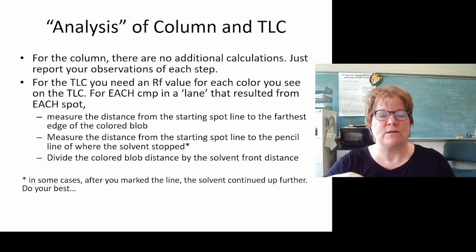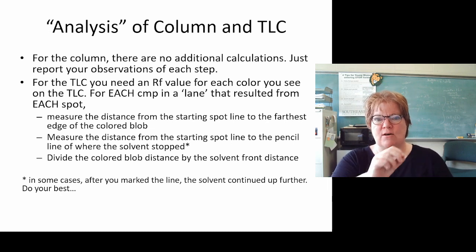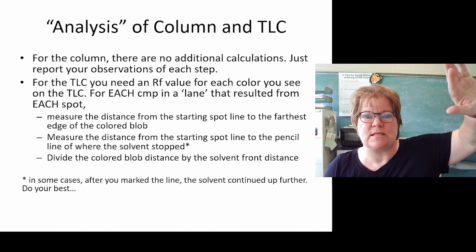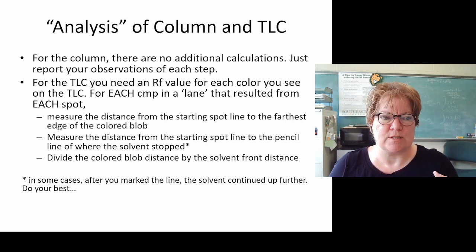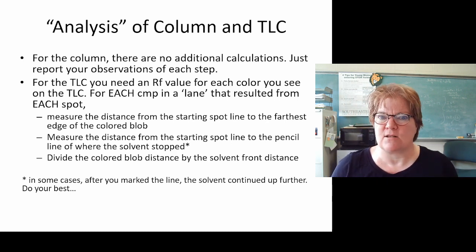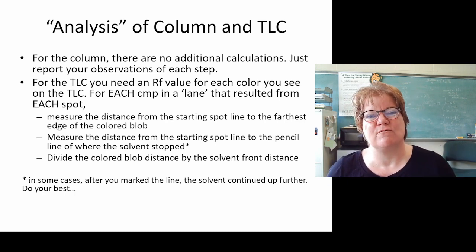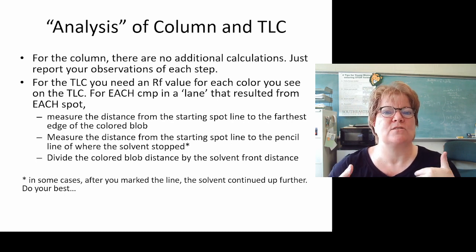And I know that when we were doing this, sometimes especially with the water, you took the TLC out and you drew the line and then you set it aside and the water kept going up. And as the water kept going up, so did the dots, especially because one of our components had a very high RF. It's almost the same distance as the solvent front. So when I divide a number by itself, I'm going to get a value of 1. So we're going to see close to RF values of 1 for the red component. But in your case, I just want you to do your best. Let's go through the process.